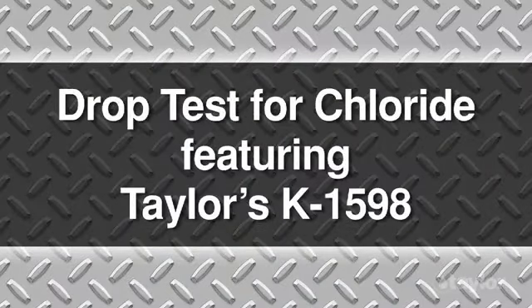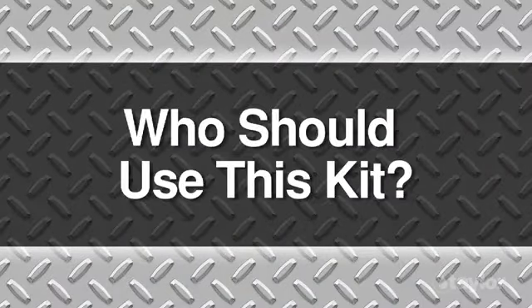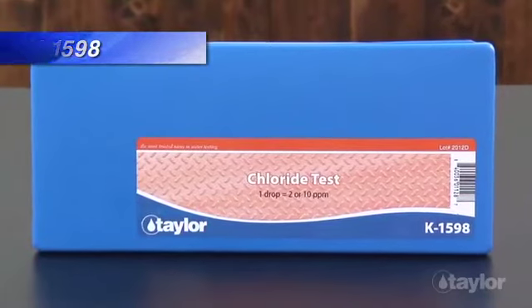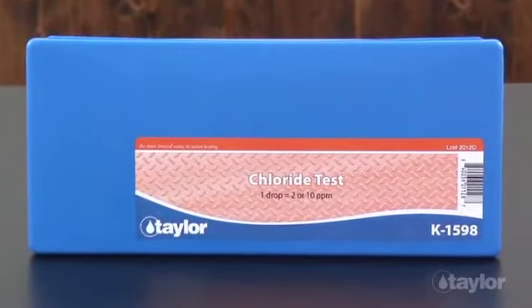Drop Test for Chloride, featuring Taylor's K-1598. Who should use this kit? Taylor's K-1598 contains a simple drop test to quickly and accurately determine chloride levels.